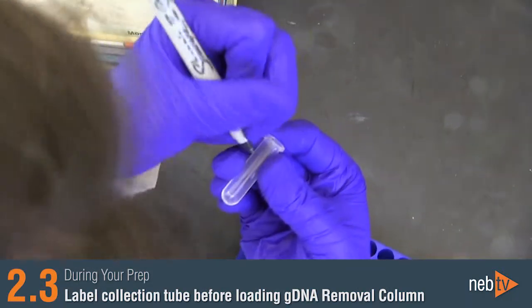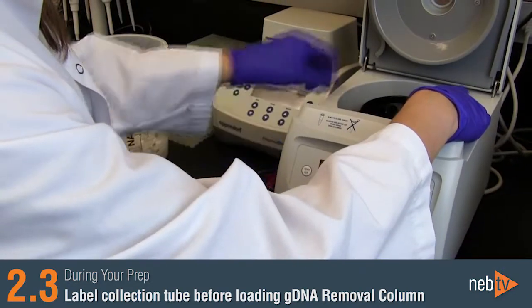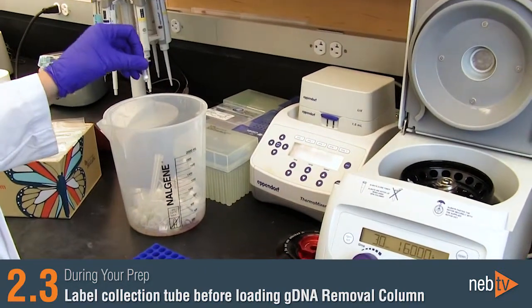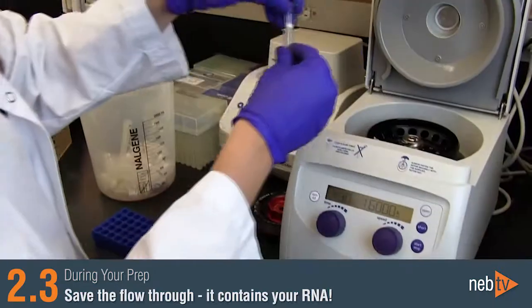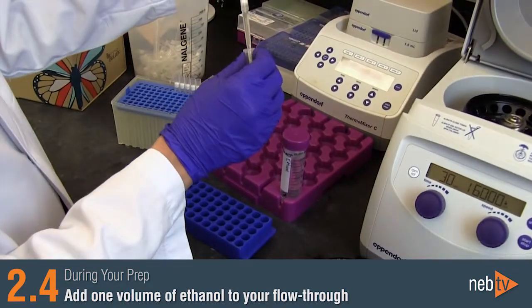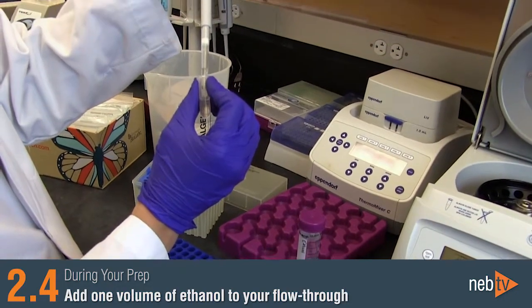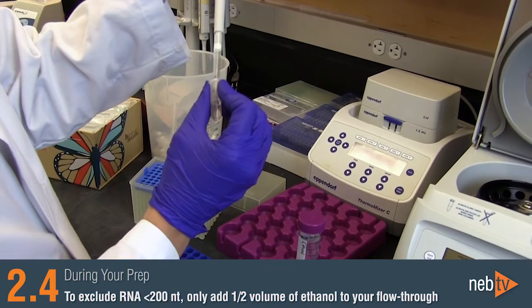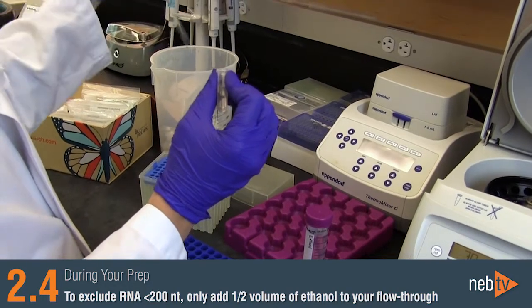Before applying your sample to the genomic DNA removal column, be sure that you label the collection tube, as you'll be discarding the column after you centrifuge. After putting your sample through the genomic DNA removal column, make sure that you save the flow-through. This flow-through contains your RNA. If you want to capture total RNA, including small RNAs, add 1 volume of ethanol to your flow-through from the gDNA removal column, in preparation for binding it to the RNA purification column. If you want to exclude RNAs smaller than 200 nucleotides, only add half the volume of ethanol to your flow-through from the gDNA removal column.